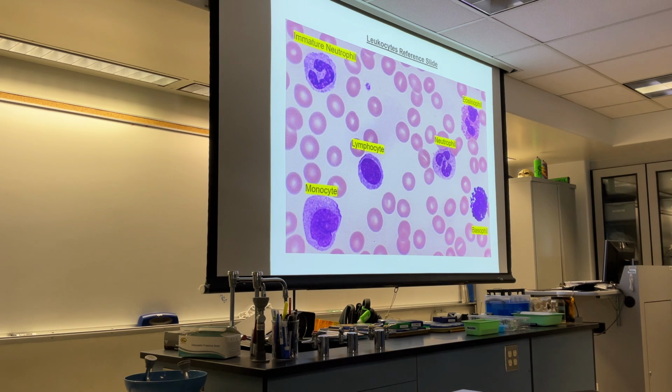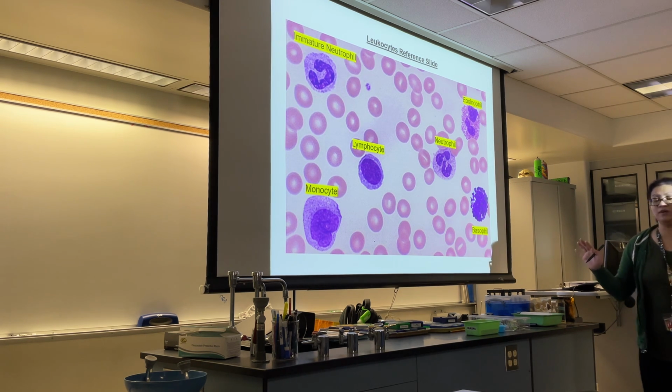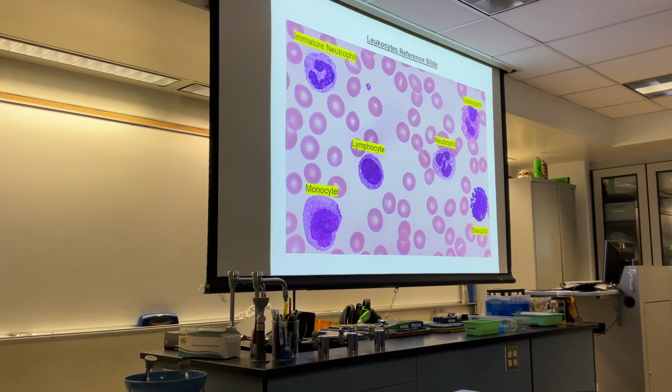And I'll go over slide 1. So I want you to notice that you basically have all 5 classes of leukocytes that were discussed in lecture on Monday here. So your job for your lab practical, because we don't really have these slides available to us, I'll essentially probably give you a picture or a handout, and then you get to identify things for me, and then I might ask you for distinguishing features.